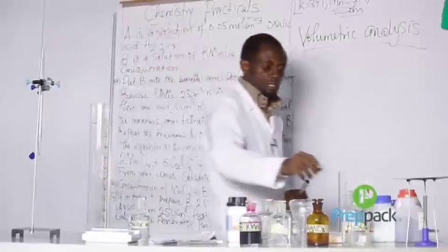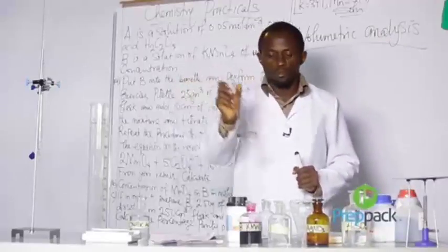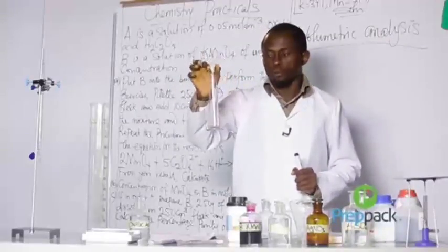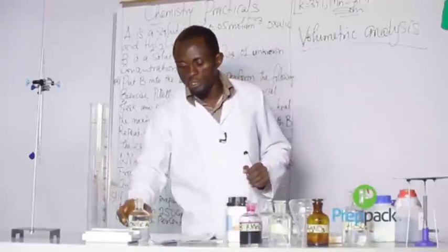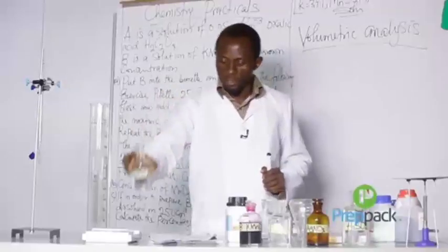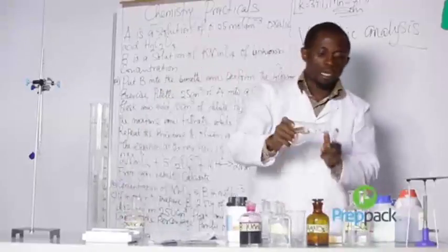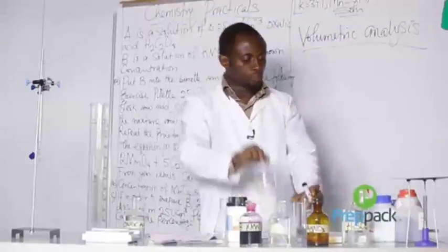Now, this is another measuring cylinder for measuring reagents of smaller volume. This is just 100 ml. This is an example of a reagent bottle with oxalic acid stored within. This is the conical flask, a measuring cylinder, and a reagent bottle.